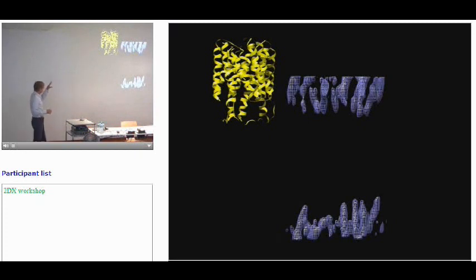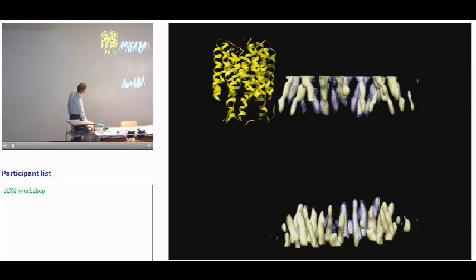The difference is that here you have used only the data in the asymmetric unit. This crystal has P6 symmetry, so your map will only be one asymmetric unit. And maybe this asymmetric unit does not cover the protein molecule that you want to cover.